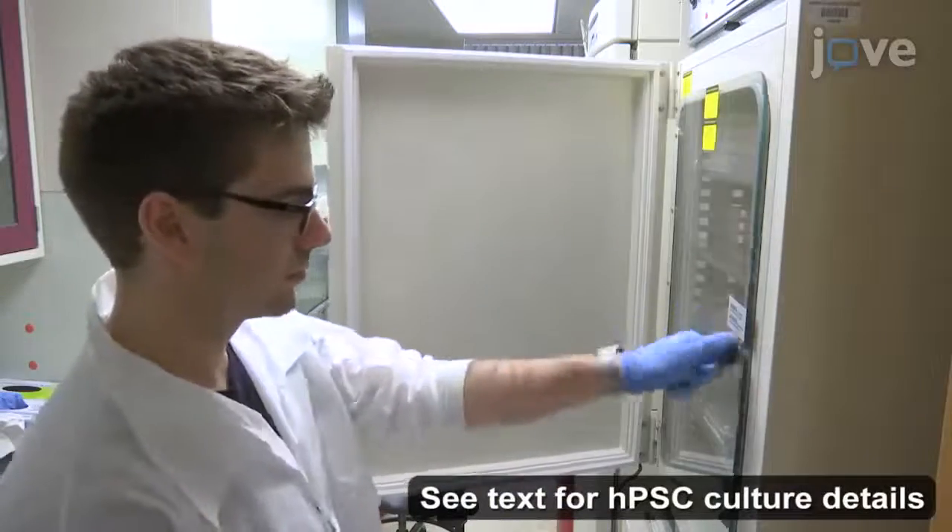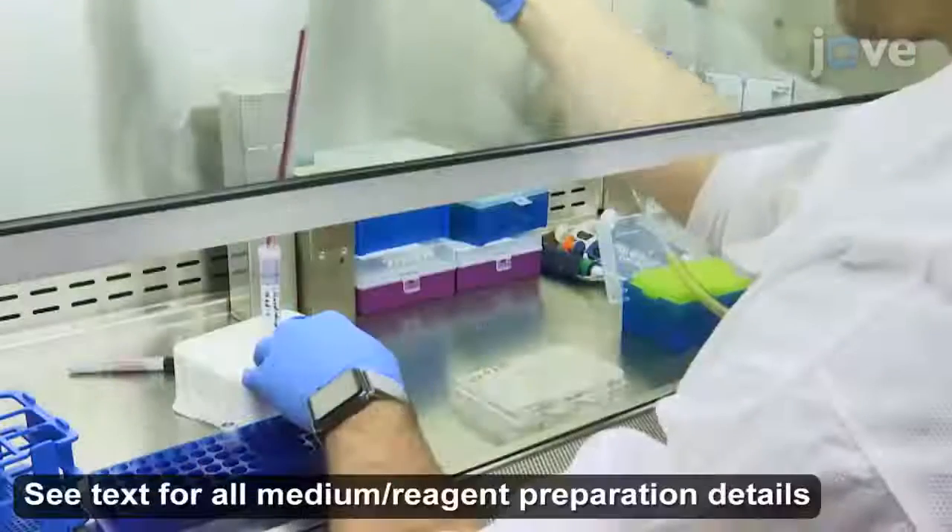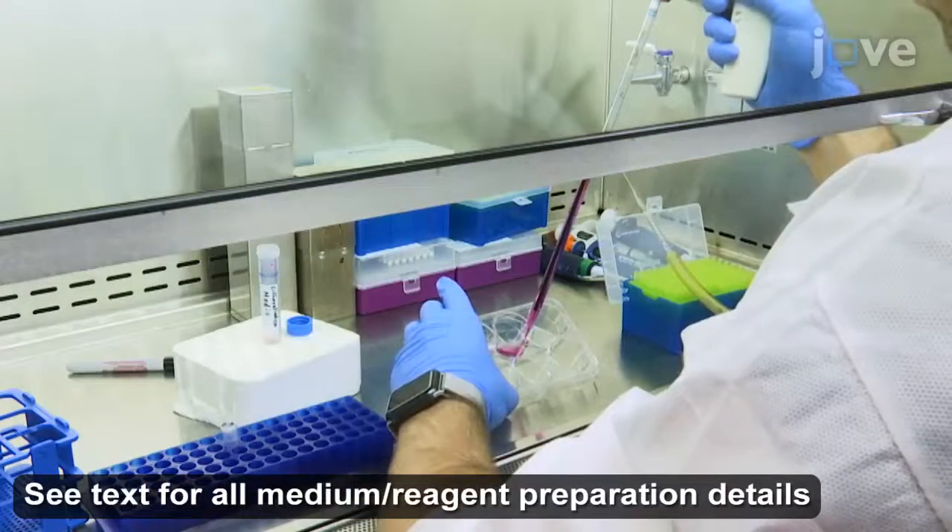When the HPSC culture reaches confluency, replace the culture medium with 4 mL of differentiation medium per well of a 6-well plate.